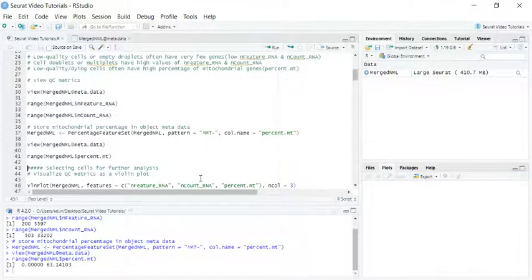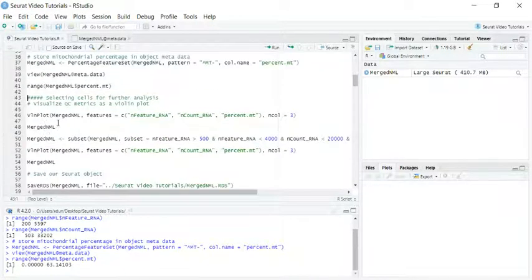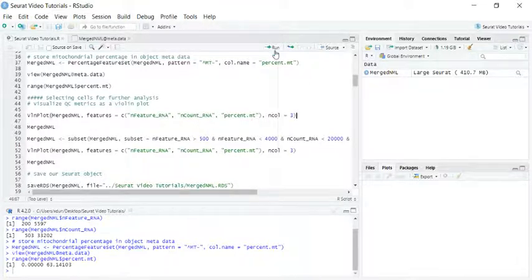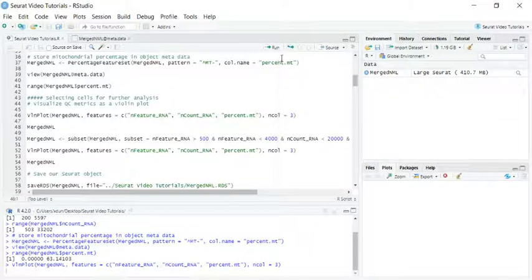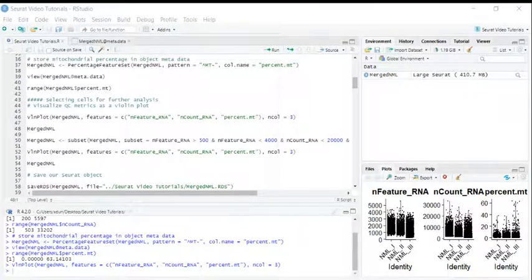Now we have all the information for n-feature RNA, n-count RNA, and the percentage of mitochondria genes. We can use the VlnPlot function to have a look at the distribution of these QC metrics for all the cells. Let's run the VlnPlot and zoom in.